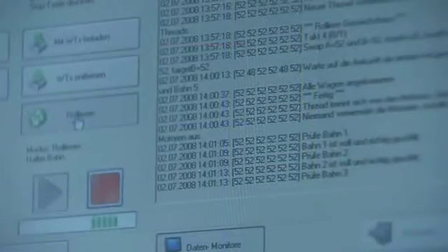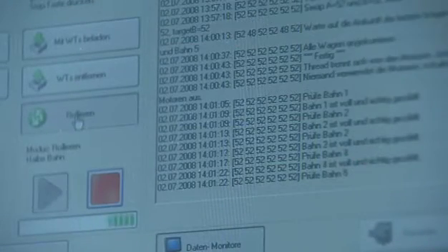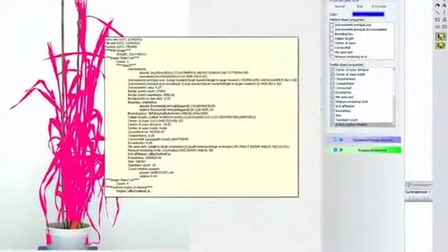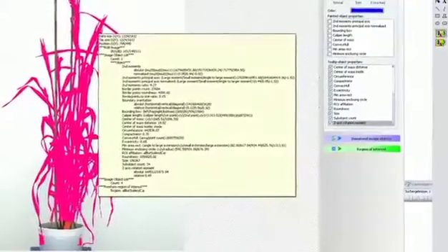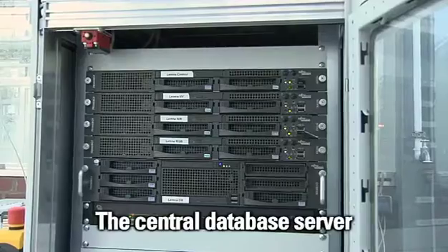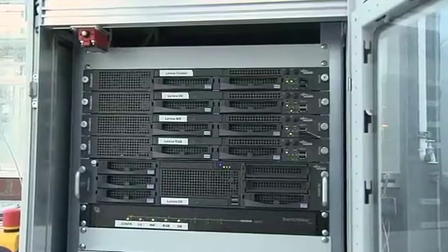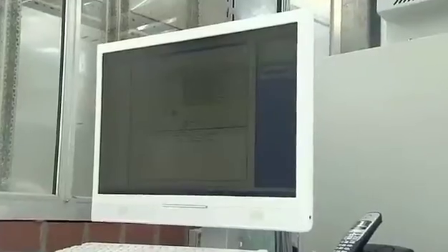All processed data are managed through a central database, the heart of all data management. Thousands of data points are produced for a whole growth period per plant and stored automatically in the fully integrated database. High-performance Zeeman servers provide state-of-the-art data technology with more than 40 terabit data handling.